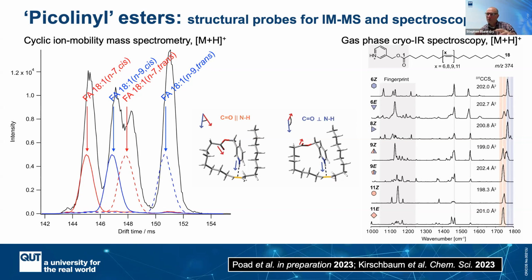So, for example, those oxidation products coming from an N7 versus an N9 double bond not only have big differences in mass, but they also splay out in mobility space as well. So that's been effective. What we would really like to do, but we're on the path to, but haven't achieved yet, is LC separation, mobility separation, and then ozonolysis.